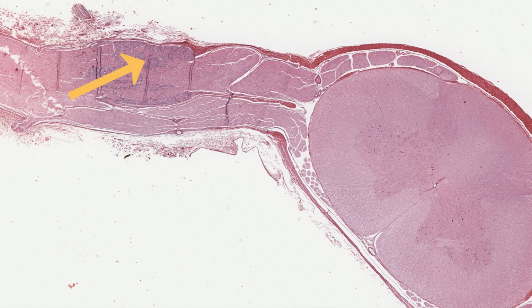Further along is the dorsal root or spinal ganglion. You're probably wondering how I can tell dorsal from ventral. Ventral horns are larger, and see this little indentation here? That's part of the ventral fissure. So here is the ventral root. Then both the dorsal and ventral roots unite beyond, or distal to, the dorsal root ganglion to form the spinal nerve.